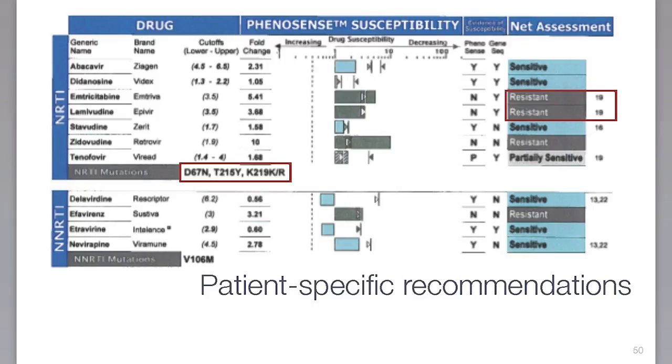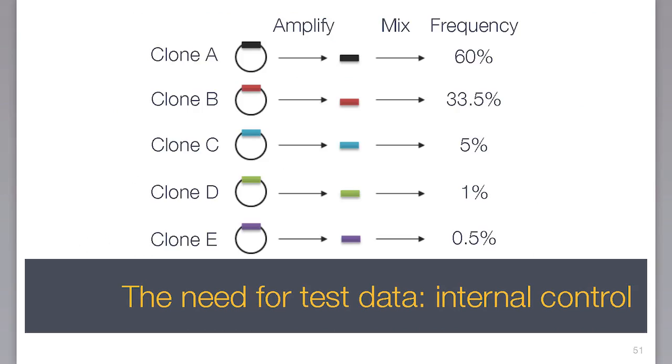So John asked us, well, can we do this properly? Can we go below 20% using Illumina sequencing? What can we do to figure out whether they have minority variants, maybe at 5%, maybe at 1%? Again, having a proper test set is important.